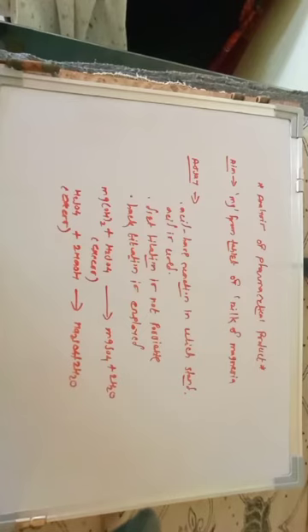You should remember why we use a back titration: because this milk of magnesia is insoluble in water, and therefore direct determination is not possible. Back titration is used when we cannot get the perfect endpoint. So the role of back titration is very important. To find the exact endpoint of this titration, you have to use back titration.